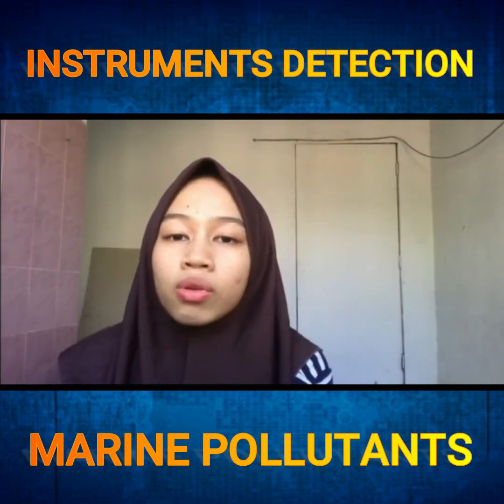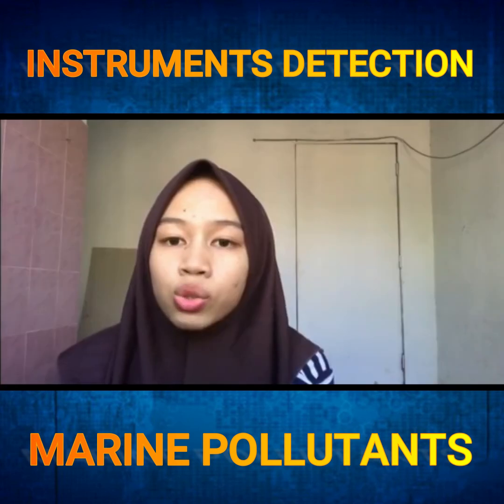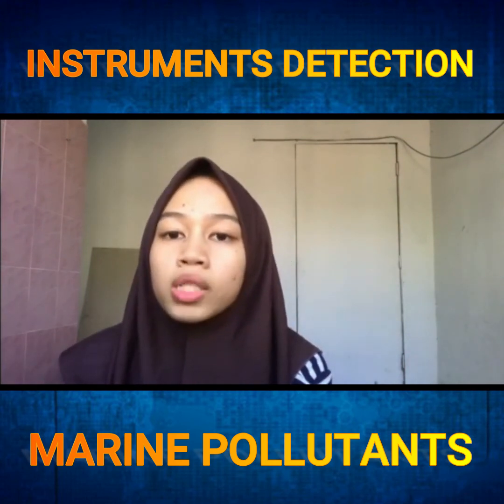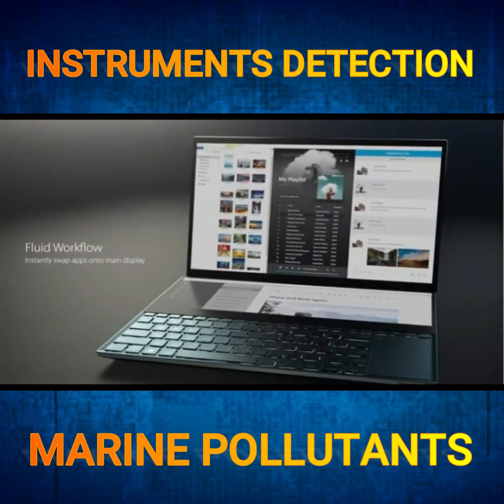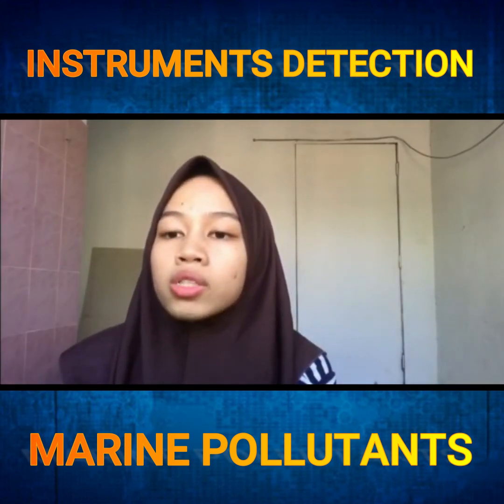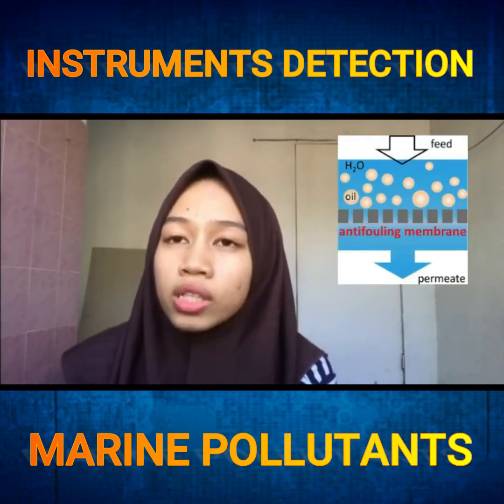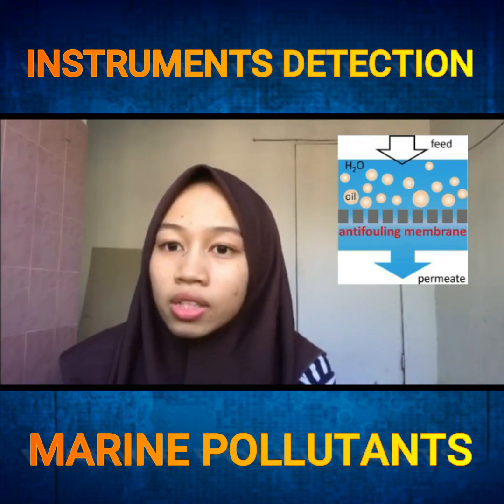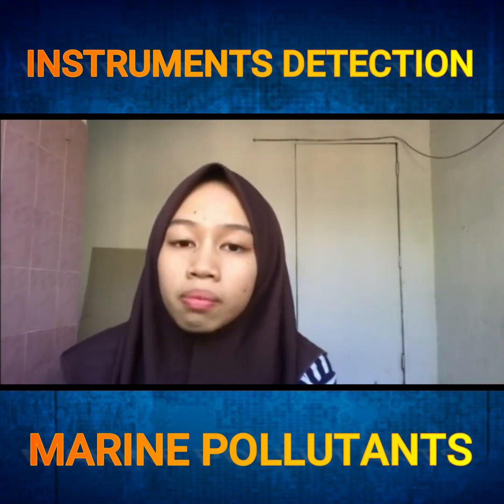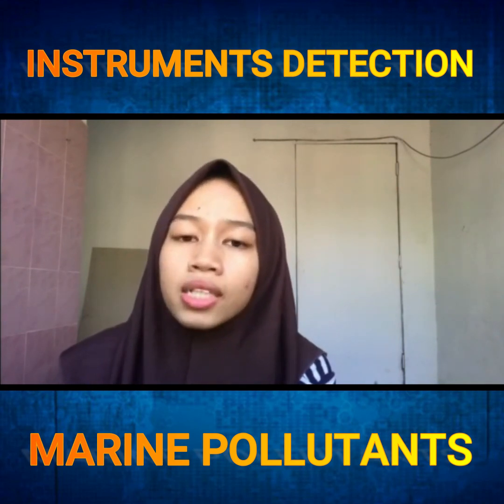The VIP system consists of a voltammetric probe with internal hardware that also houses a voltammetric cell through which the sample is passed using a peristaltic pump. The voltammetric probe is remotely operated from the surface via a laptop by means of a coaxial cable that enables data transmission. The heart of the submersible voltammetric probe is a Hg-plated Ir-based microsensor covered with an anti-fouling gel membrane. What is this gel's function? The gel plays an important role in this system. This gel-integrated microsensor allows direct voltammetric measurement of trace metals in complex media without physical and chemical interference of the test solution.